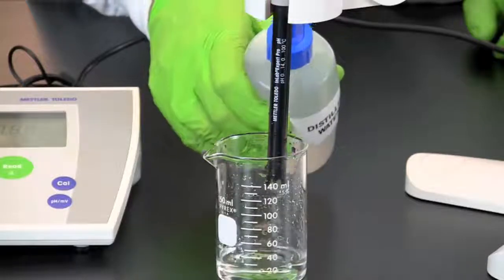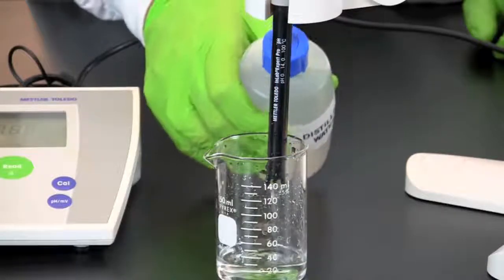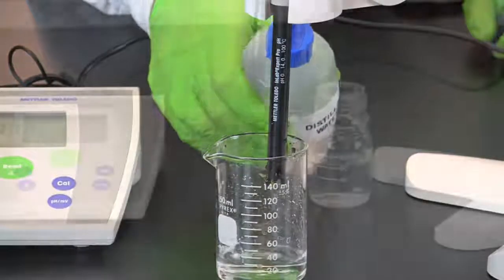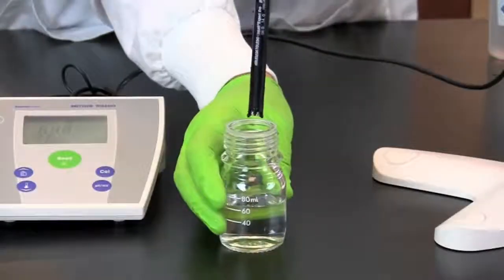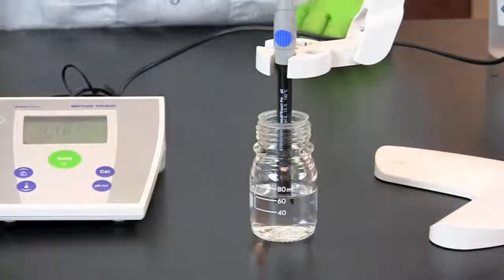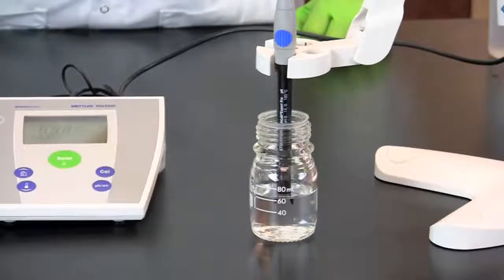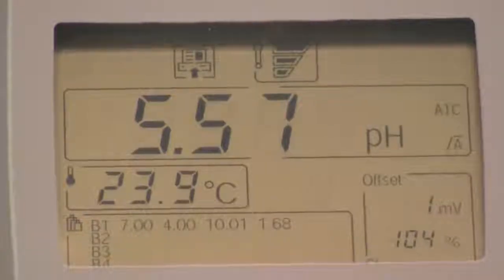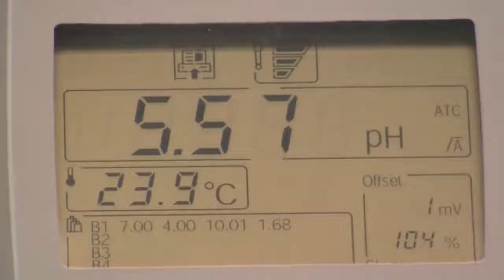You are now ready to measure the pH of an unknown solution. Place the unknown solution beneath the electrode and slowly lower the arm so that the electrode is fully submerged in the solution. This sample has a pH of 5.57 at a temperature of 23.9 degrees Celsius.